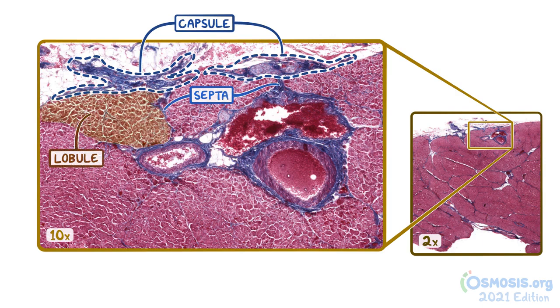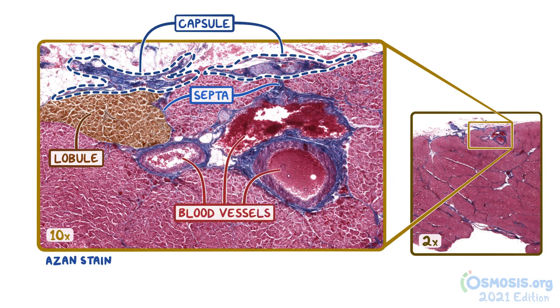This section of the pancreas was prepared with Azin stain, which stains collagen in a bluish-purple color in order to highlight structures like the capsule, septa, as well as the connective tissue that surrounds large blood vessels.